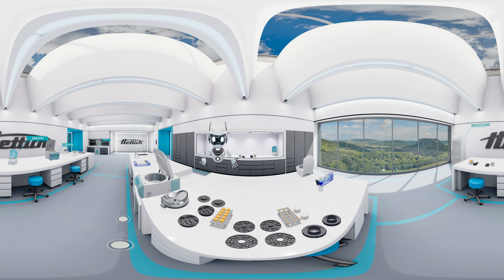It was a pleasure to introduce you to the new Zentromix 380R. Please feel free to investigate the Zentromix in more detail. You can grab the Zentromix and all the other parts for an exact examination. We wish you a lot of fun!